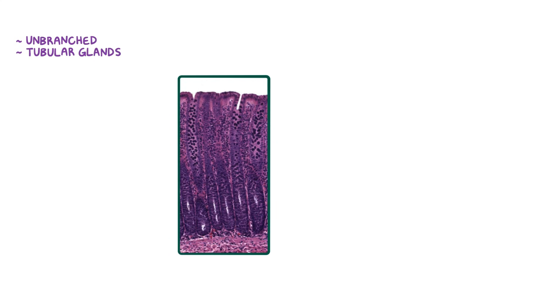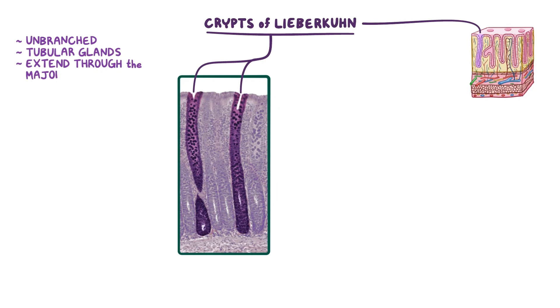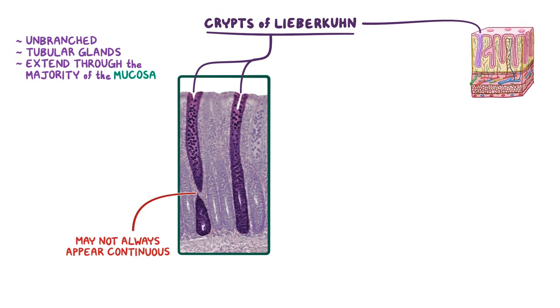The surface epithelium is continuous with straight, unbranched, tubular glands called the crypts of Lieberkühn. Unlike the crypts in the small intestine, these crypts extend through the majority of the mucosa, from their openings at the intestinal surface all the way to the muscularis mucosa along the deepest portion of the overall mucosa. It may not always appear to be continuous on histological slides, because the path of the crypts may not always travel along the same plane as the section of tissue taken from the colon.